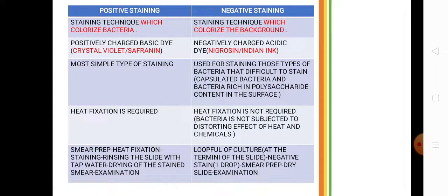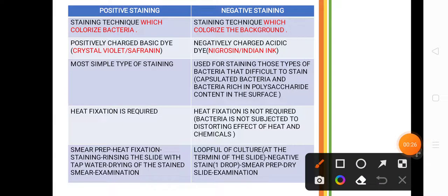So today we are going to start another video lecture series where we will talk about the practicals, the practicals related to our field. In the first video of this playlist we will talk about the difference between positive staining and negative staining. We all know how important staining techniques are, right?